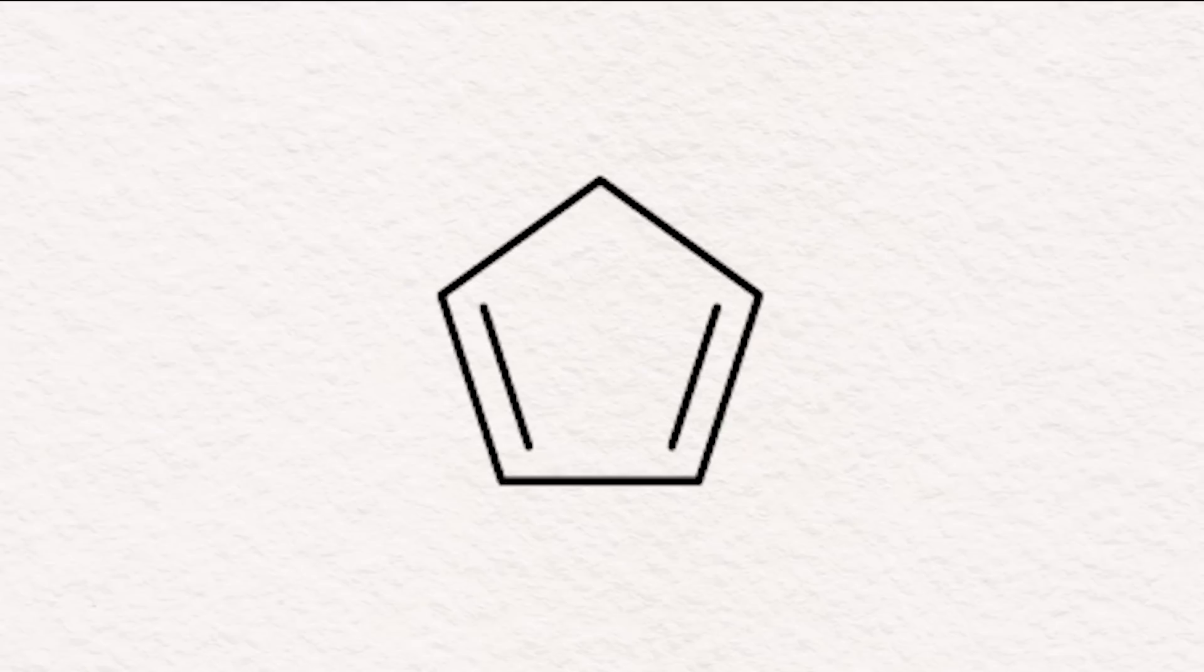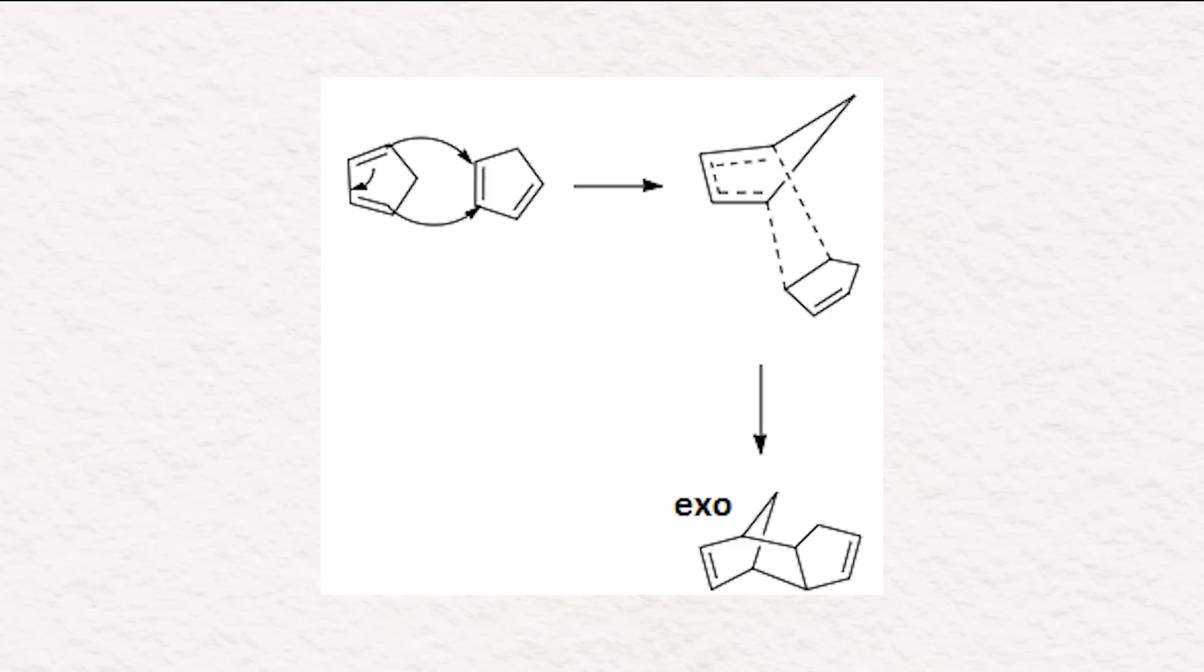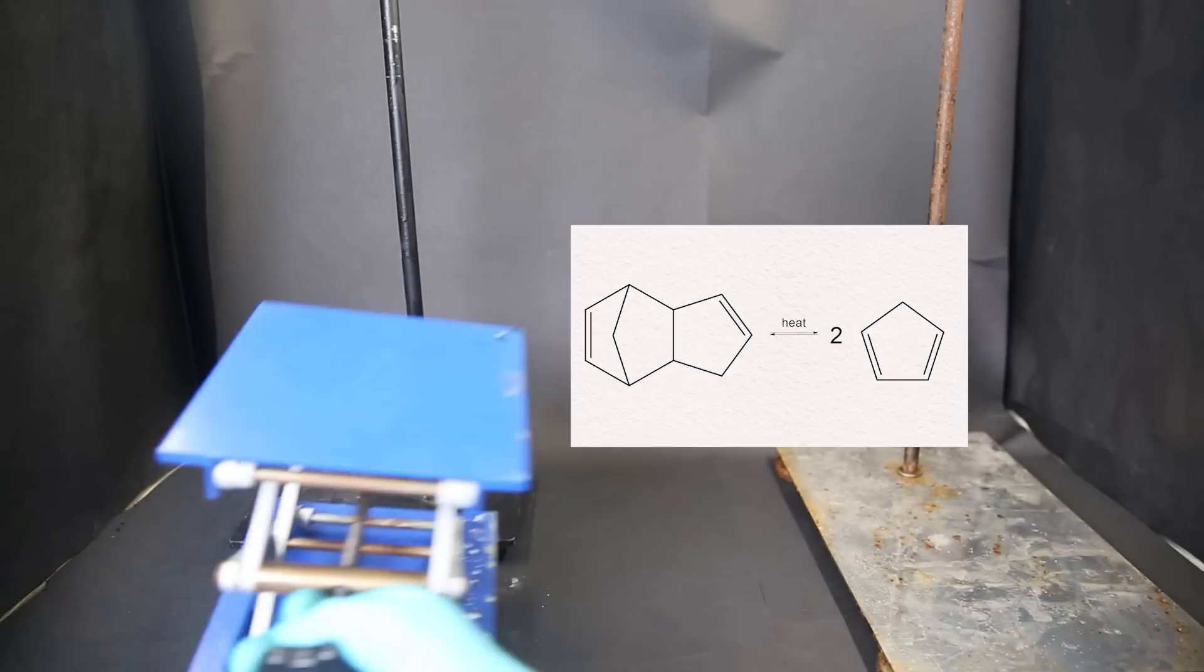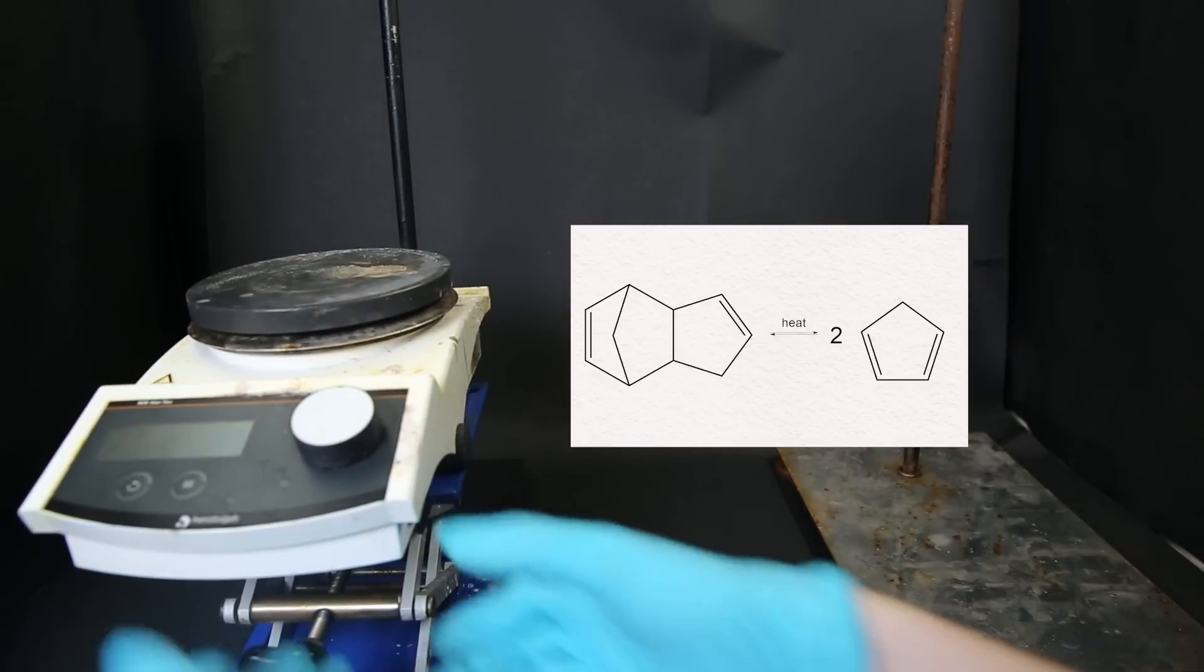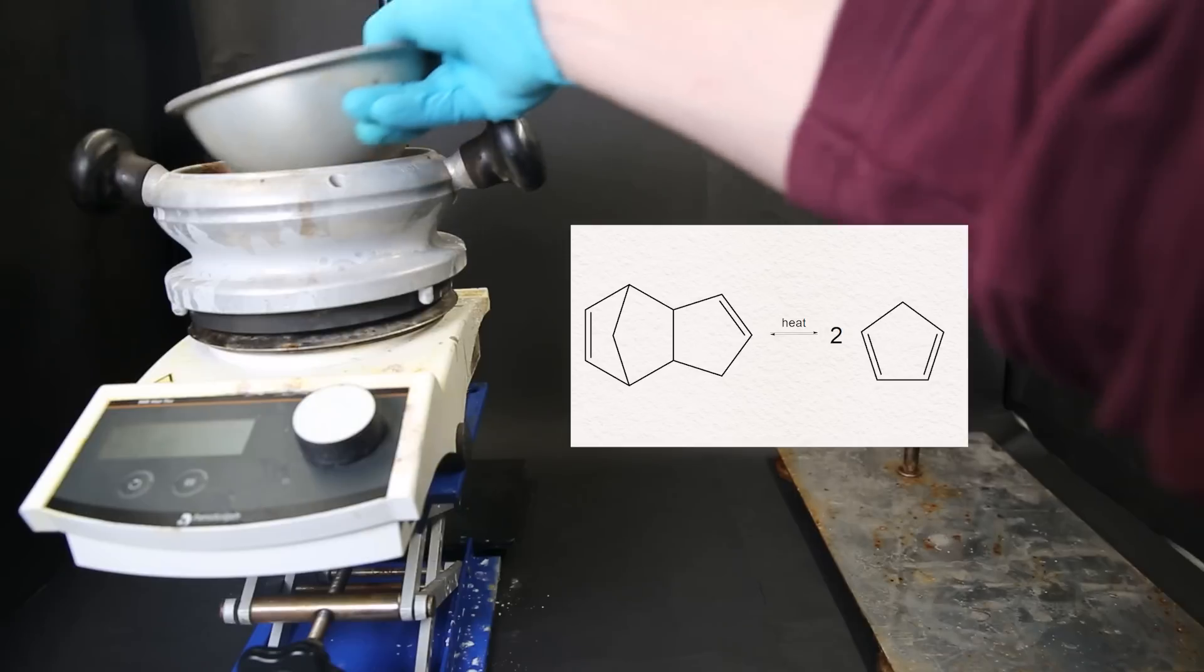Before I can start with the synthesis of ferrocene, I have to produce some fresh cyclopentadiene. Since cyclopentadiene is unstable, and two cyclopentadiene molecules easily undergo a Diels-Alder reaction, we have to crack it from the product dicyclopentadiene. With strong heating, this molecule will fall apart back into two cyclopentadiene molecules.